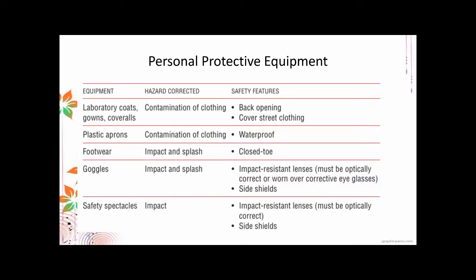Now, aside from the biosafety cabinet, some of the personal protective equipment used in the laboratories, you have, of course, the laboratory gowns, lab coats, and also coveralls. So they help correct the hazards of contaminating the clothing. So it prevents your clothing from being contaminated.